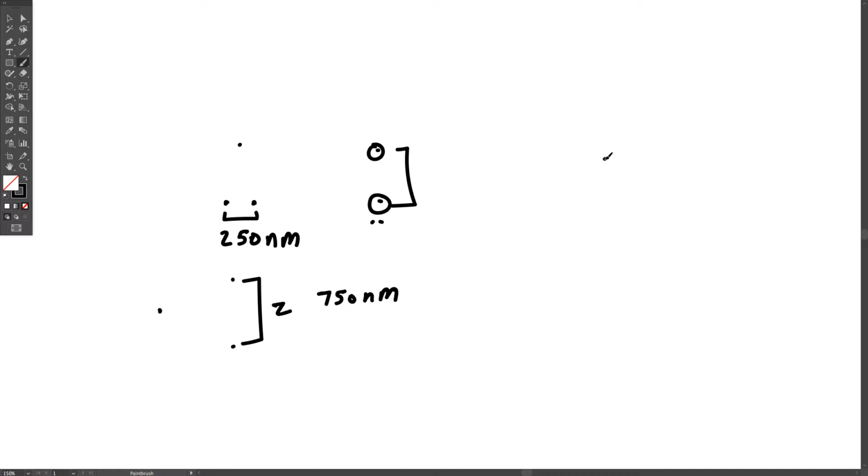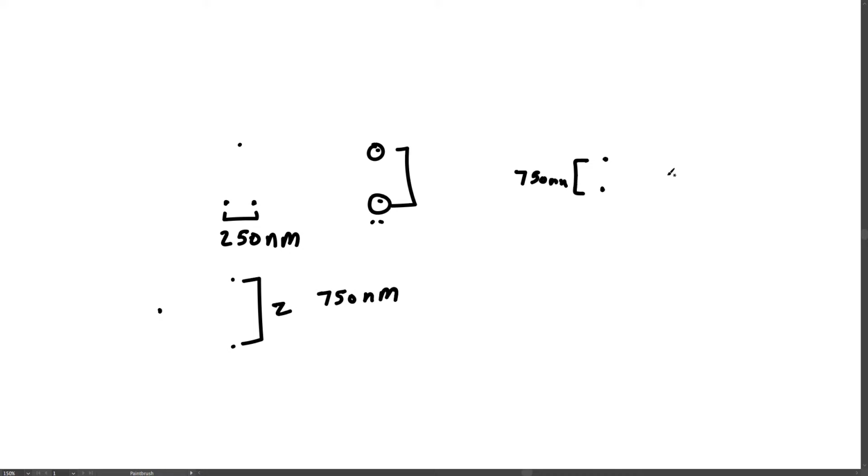If you had two objects that were one over the other, but still closer than 750 nanometers, then, as I said, it would appear as a dot if you were looking at it in the light microscope. But if you then embedded this piece of tissue in resin, let's do it a different way. You have two objects, and then you have one object like this.